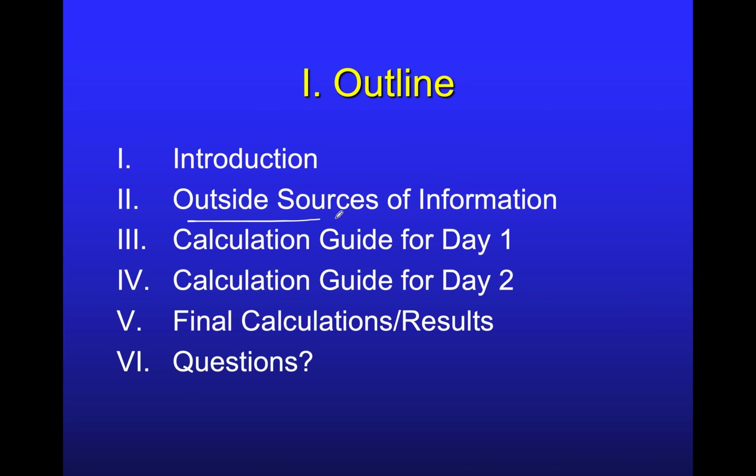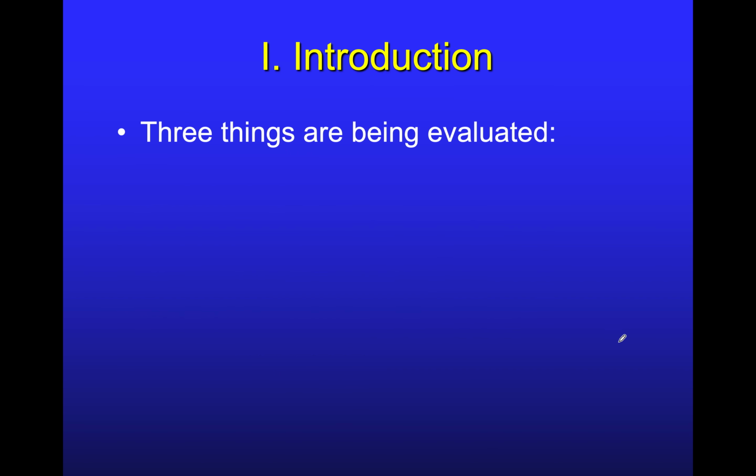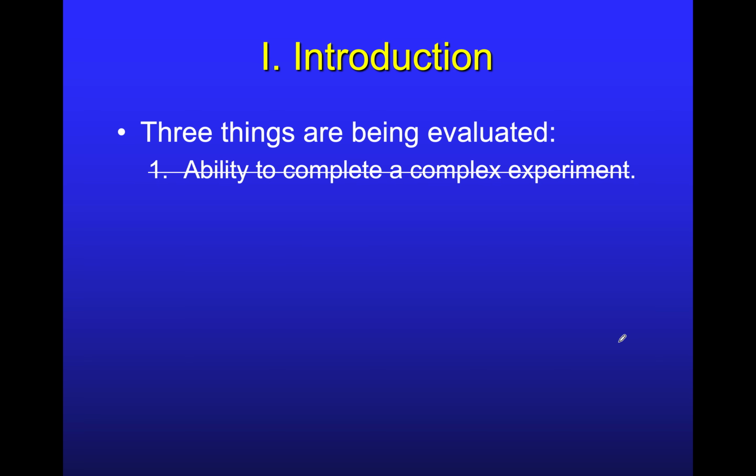So there's introduction. This is going to be a great resource of information for you. I have lots of sources that you can go to because questions are going to come up, and this is a place for you to see where you can get those questions answered. Instructions for calculations, day 1, day 2, and then how to finally report your answer. So the introduction: 3 things that are being evaluated. Well, the first was the ability to complete a complex experiment.